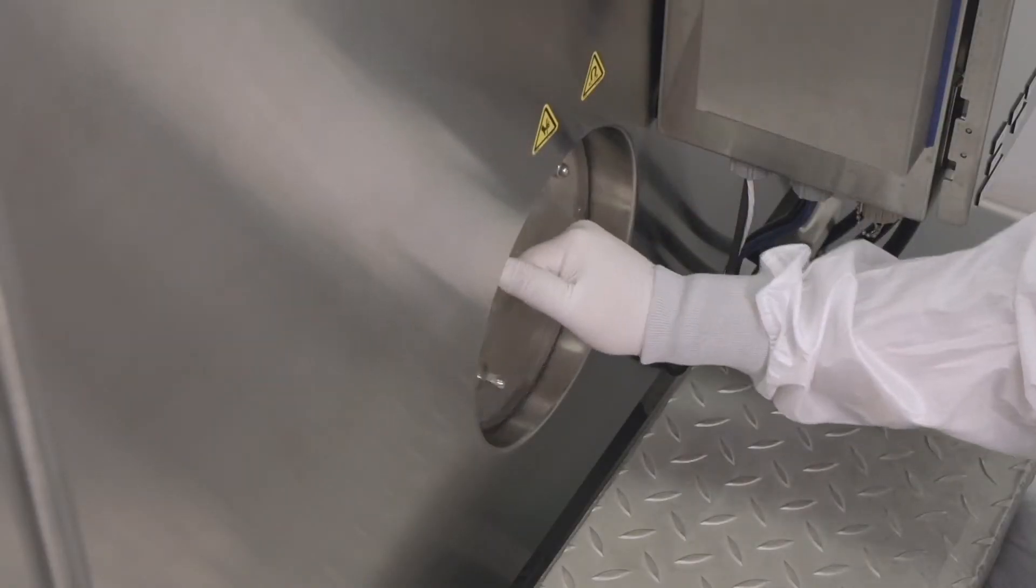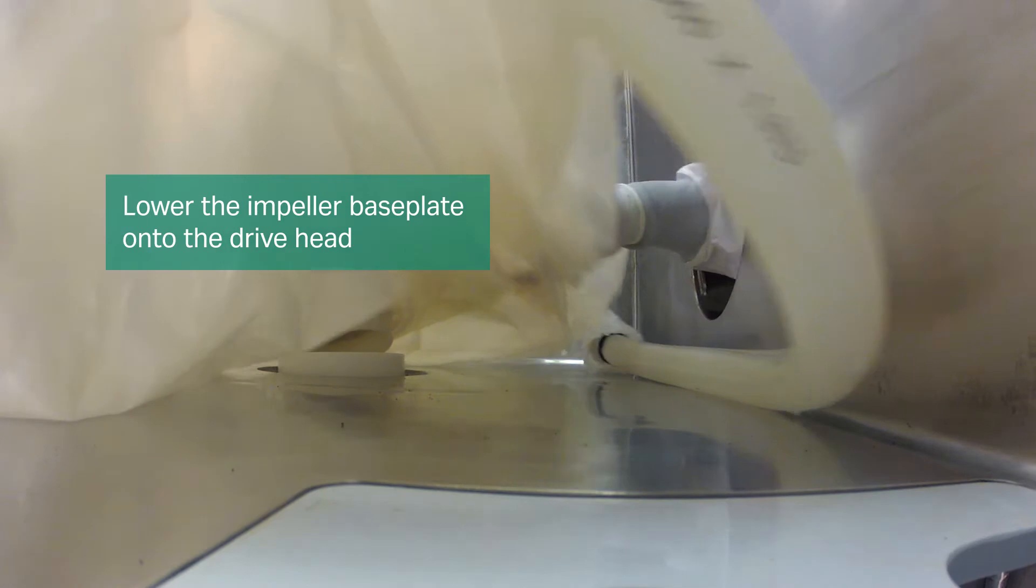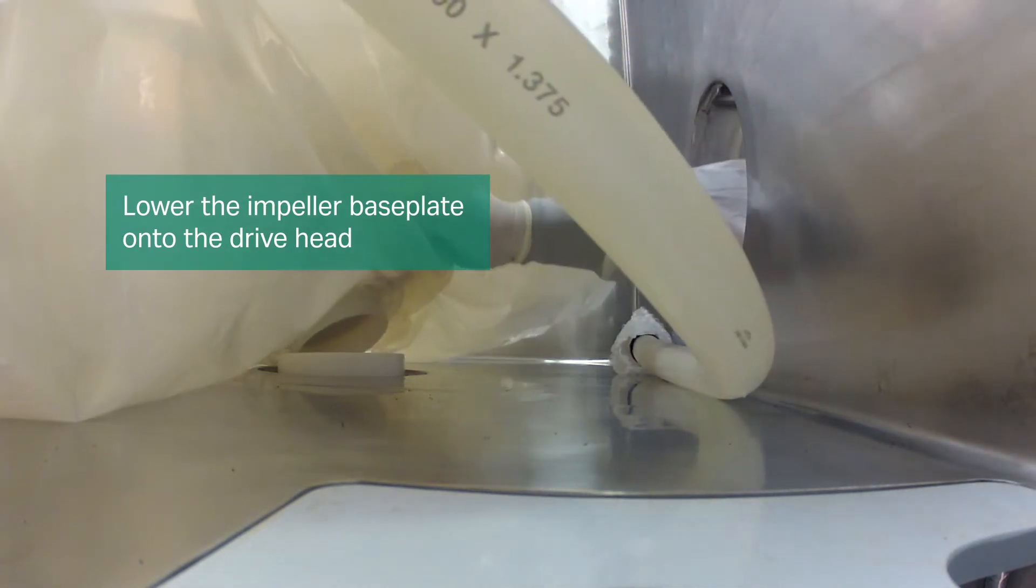Remove the access doors on both sides of the vessel. Position the impeller base plates above the magnetic drive heads.